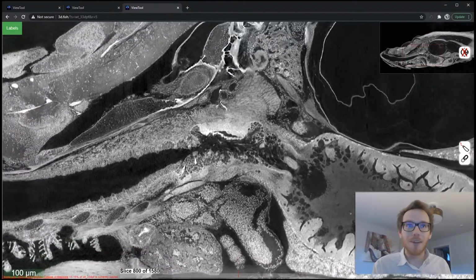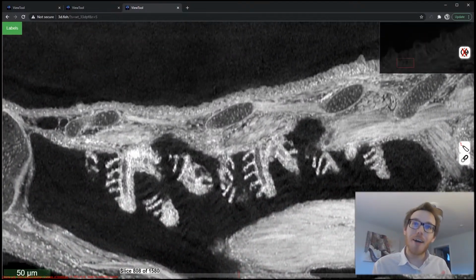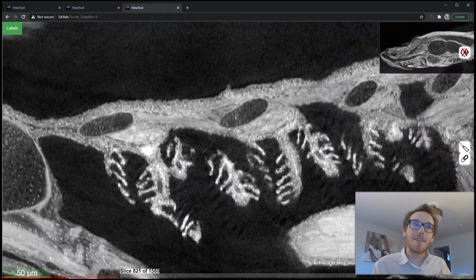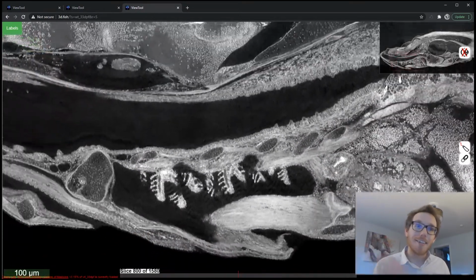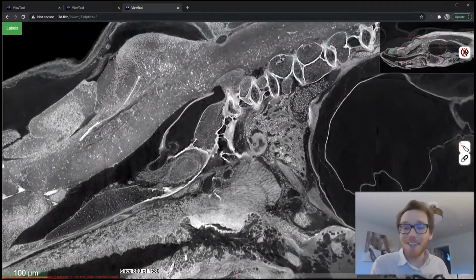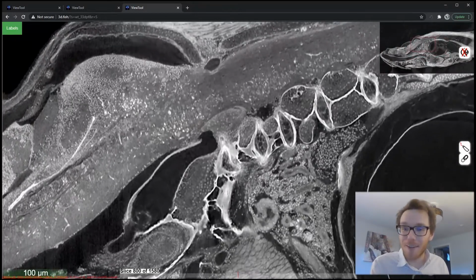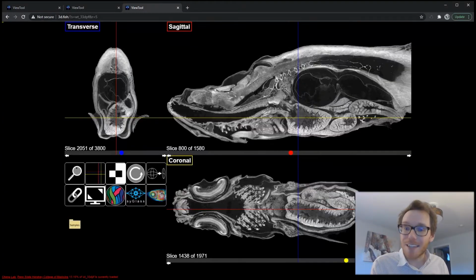So we're going in and we're going to look at these same gills that we made the video of earlier. And just going to look at the data. It's really beautiful. The address is 3d.fish, and you can load these up and look at them anytime. You can send us links to it.